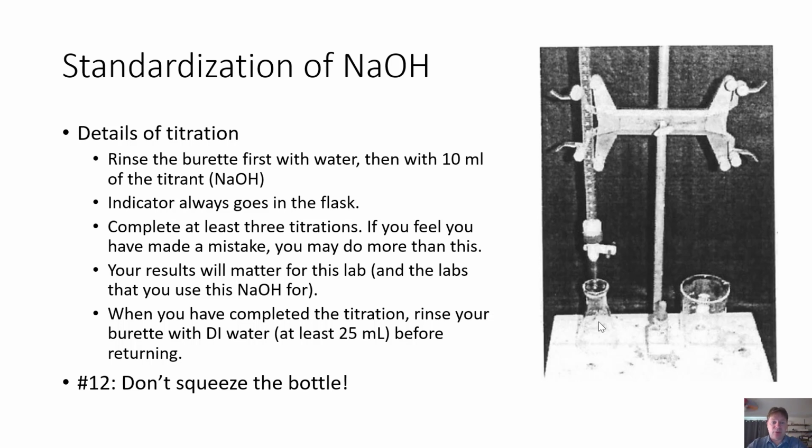When you have completed the titration, go ahead and rinse out your burette with DI water. If you don't do that, it will jam it up. That will make it difficult for someone else to use it later. So make sure you're rinsing it out before you go. Also, clean up your area very well, both the lab surfaces, and then if there was anything near a balance, make sure you're cleaning that up as well. You're not going to be putting the sodium hydroxide pellets directly on the balance. You should be using a weigh boat for that. But if anything does somehow get on there, we want to make sure that's part of our cleanup activity.